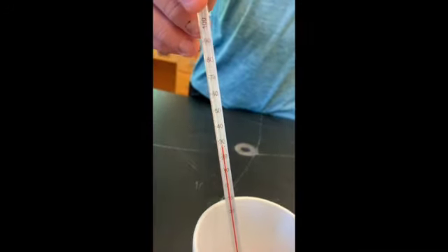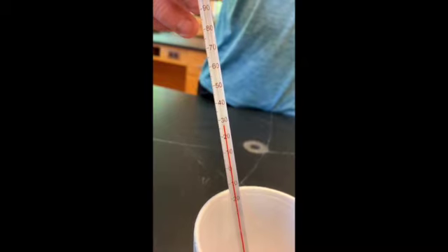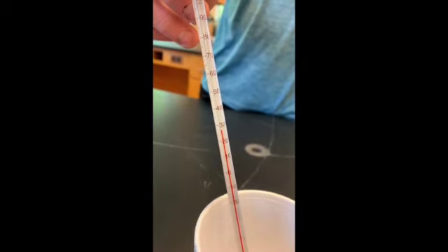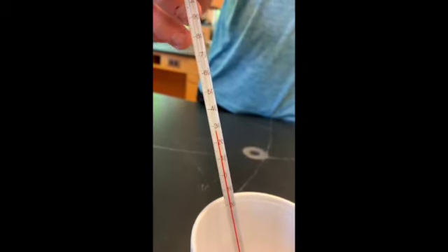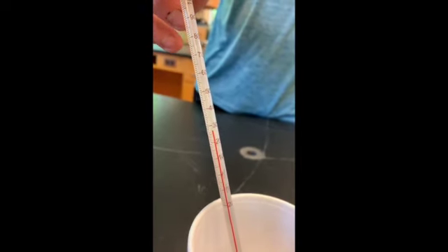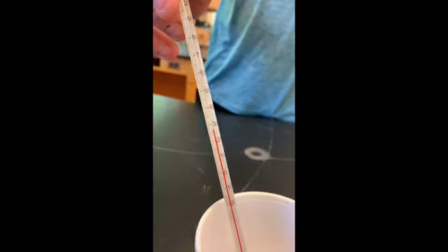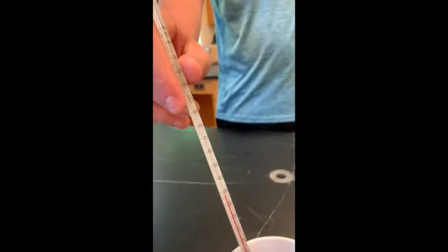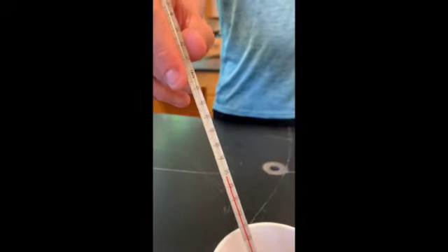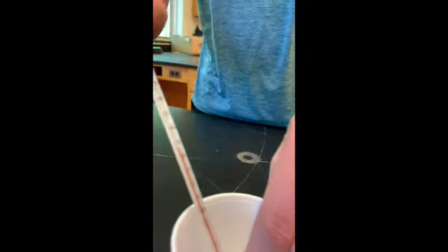Stop twisting it, please. Alrighty. It is warm in the room today because our hydrochloric acid's pretty warm. Okay. So that is our initial temperature of our hydrochloric acid. Again, make sure that you record that. Maurice is now going to add the magnesium to the hydrochloric acid. All right, and we're going to see what happens to the temperature.